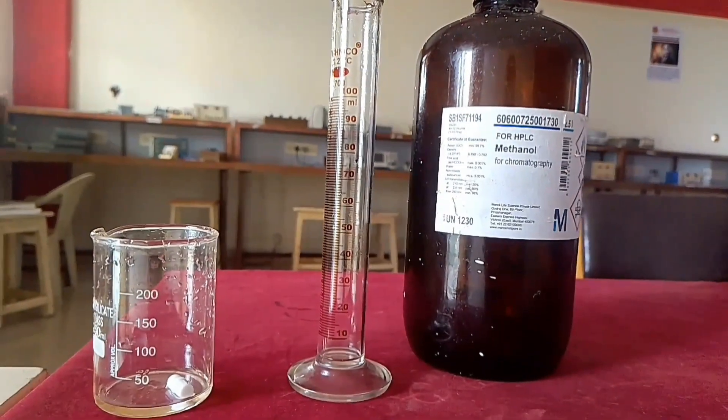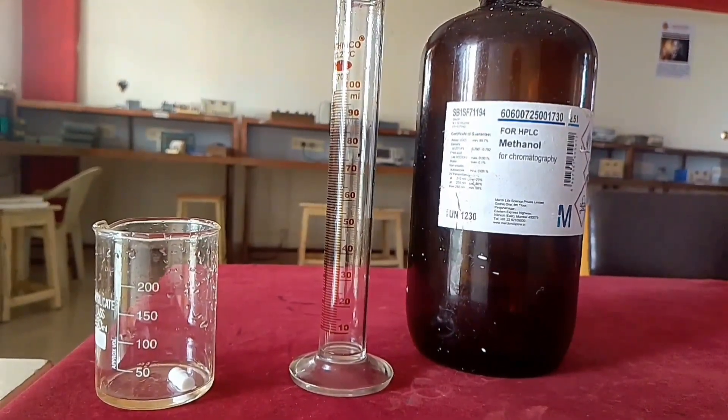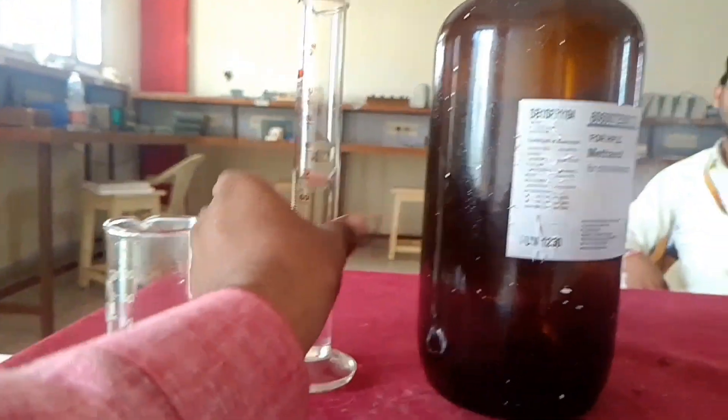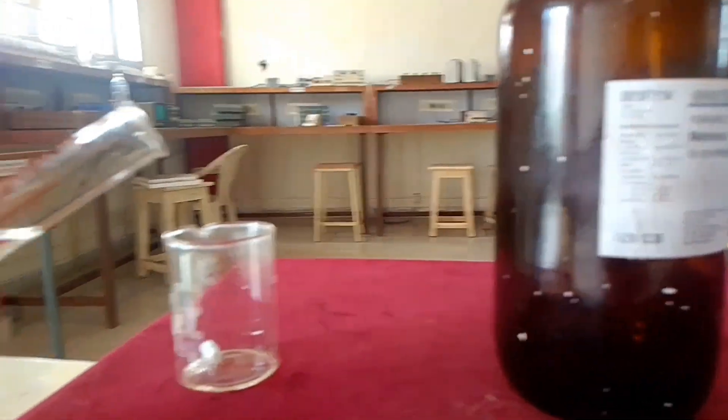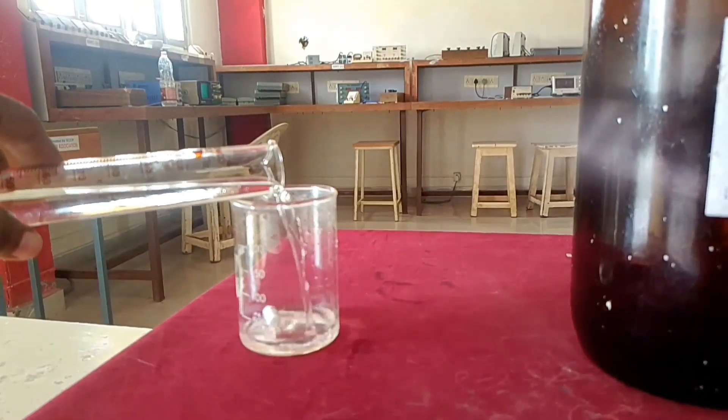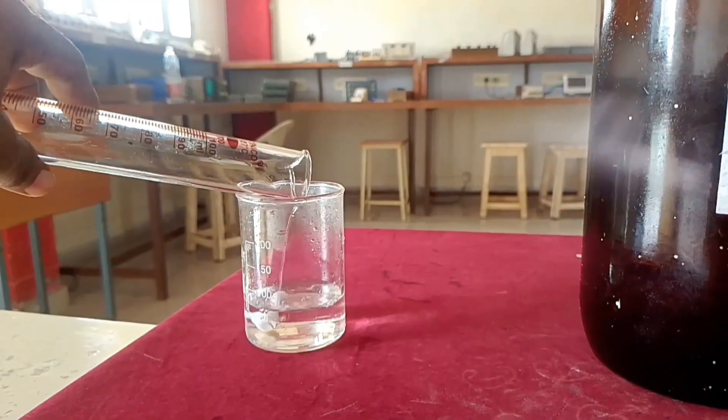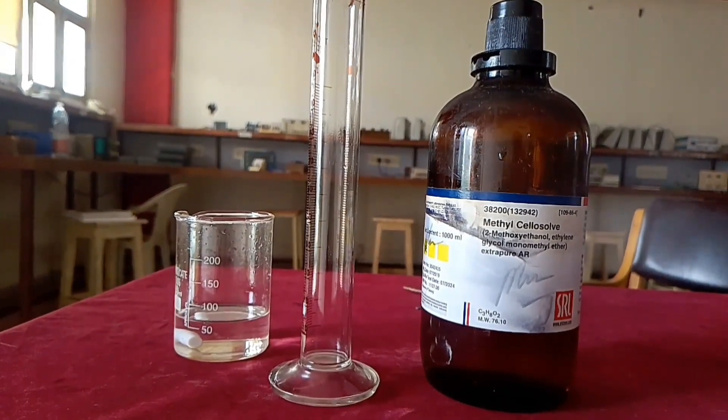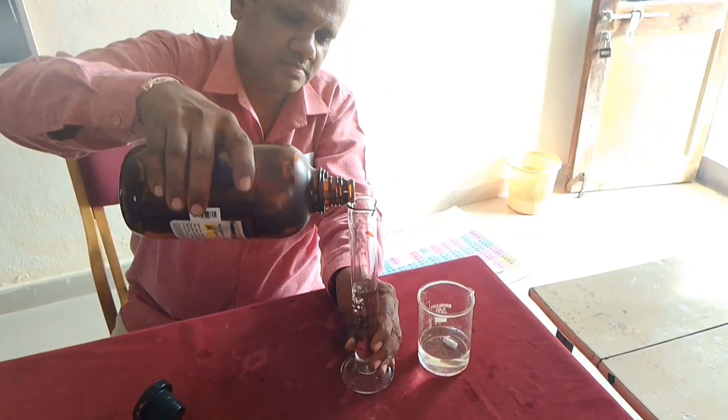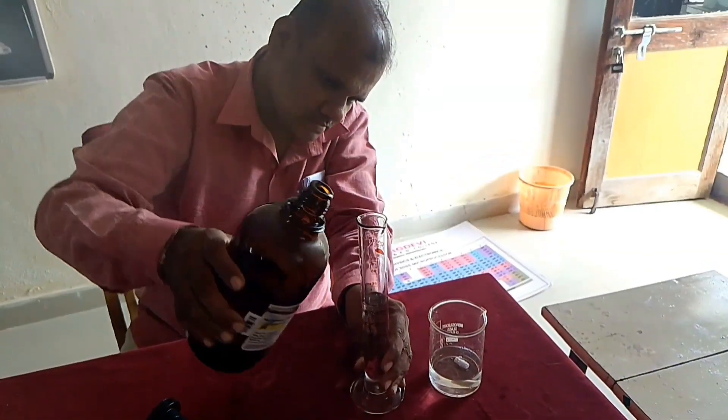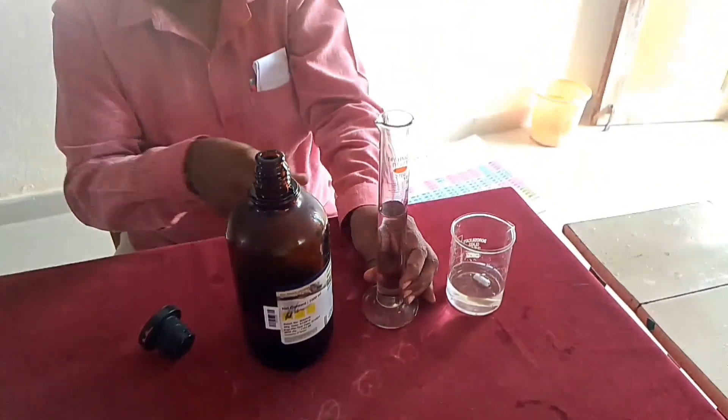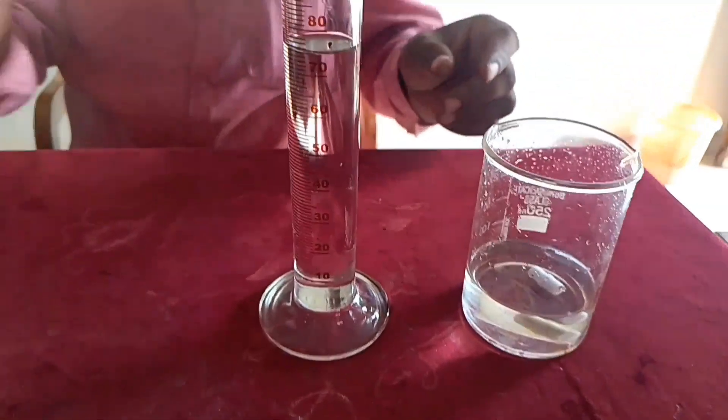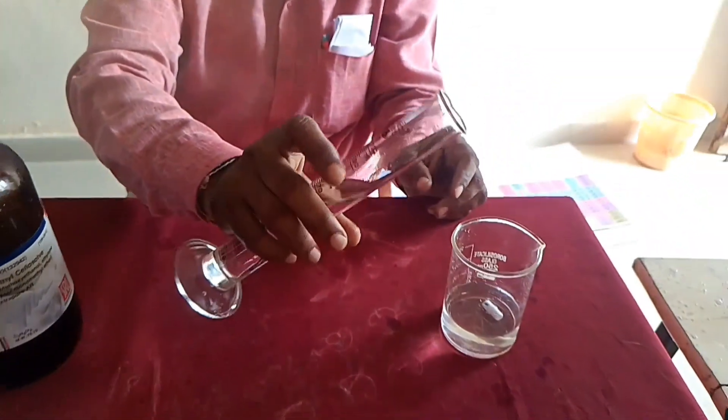Here I am going to take the blending of two solvents: one solvent is methanol, another is 2-methoxyethanol which is also known as methyl cellosolve. With the help of a measuring jar I am going to take 75 ml of methanol. The rest 75 ml is 2-methoxyethanol, so 75 ml of methyl cellosolve is added to the beaker which is already containing 75 ml of methanol.